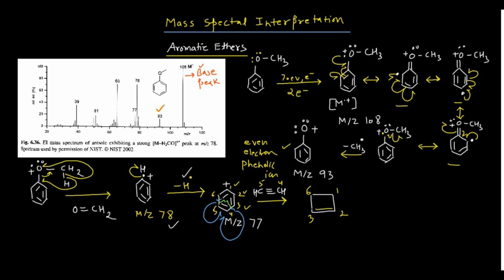So you can put this here, just like you can put it here. You see, at position number 1 you have the positive charge, so you can put a positive sign. Now the question is, how have I made this particular ring? When you break this system, 1, 2, 3 and 6, this bond and this bond are already there, and the electron pair coming from the cleavage of this bond will make a pair, and this pair will get connected with this system. That's why the ring is completed now.